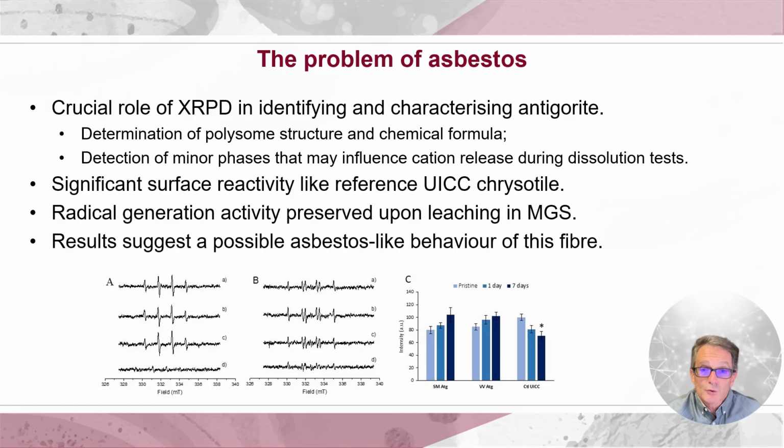This mineral shows significant surface reactivity comparable to reference chrysotile. Its radical generation activity is preserved even after leaching in modified Gamble solution. Overall, these results suggest a possible asbestos-like behavior of this fiber.